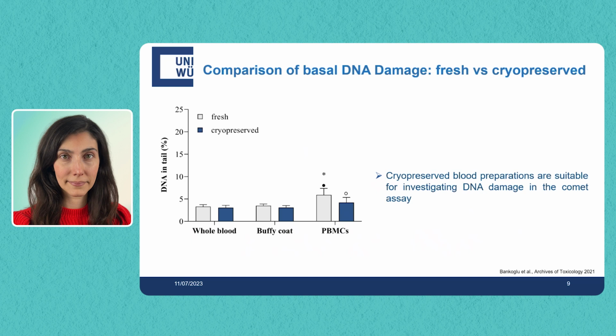What you can see here is that we have no difference between the fresh and cryopreserved samples in any of these blood preparations. Basically, up to a year, we didn't see any increase in the basal DNA damage, and we could use all these three blood samples.